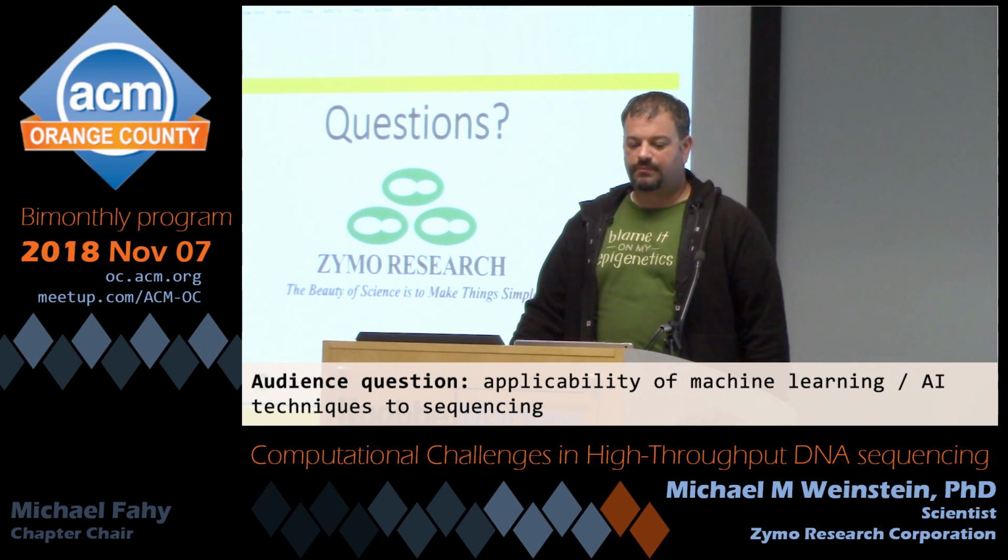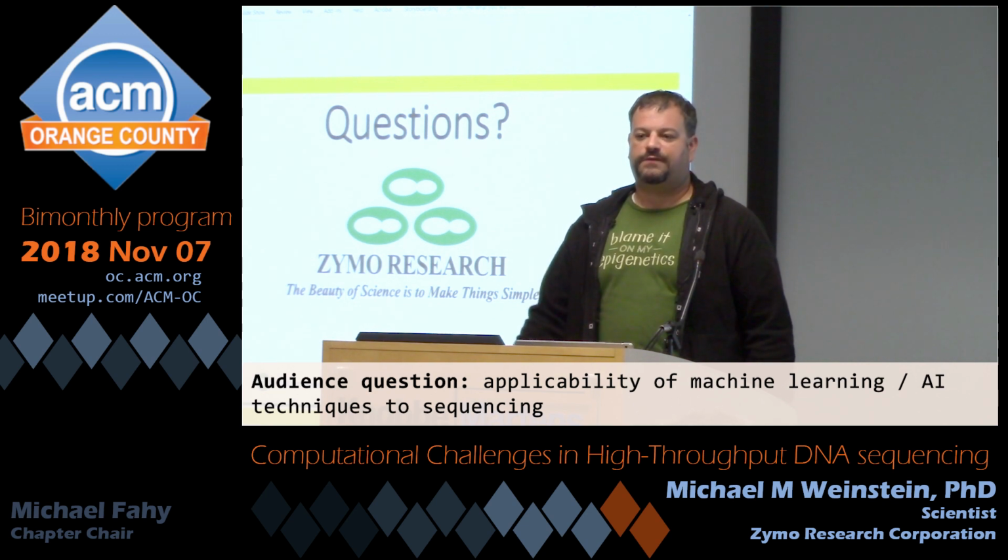So there are some models available, either open source? Yeah, in fact, I think the National Cancer Institute has a couple of data sets available, and every once in a while they'll issue a challenge to have people try to find more accurate error calling on it.